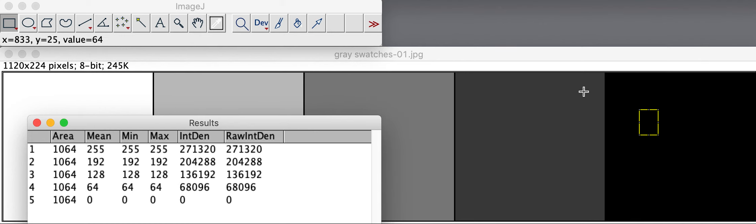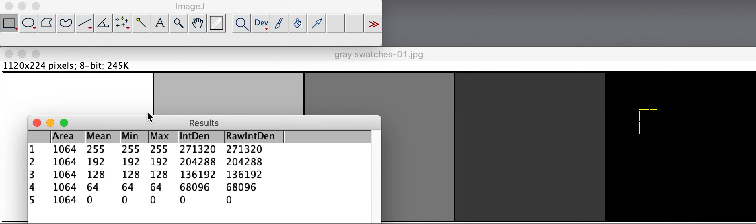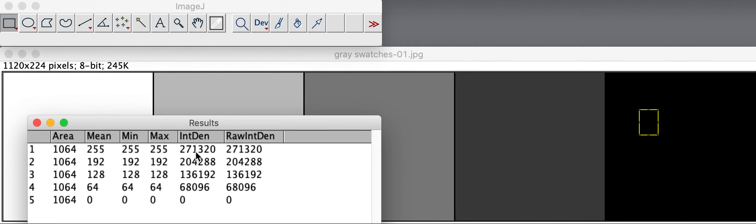In other words, an image that's pure black would have no light transmission or zero light transmission. And in this case, a clear sample of what we would see as white in this example has maximum transmission of, in this case, 271,320.